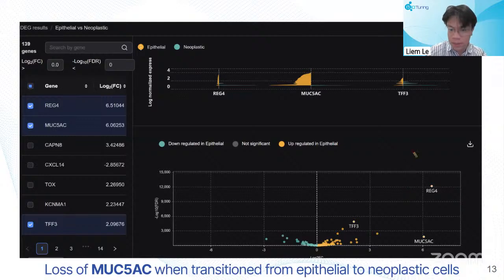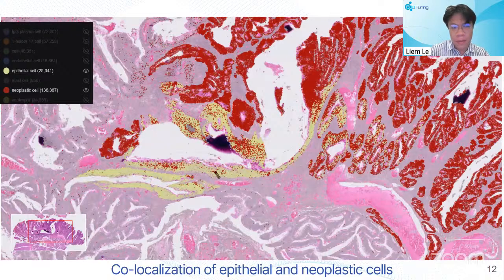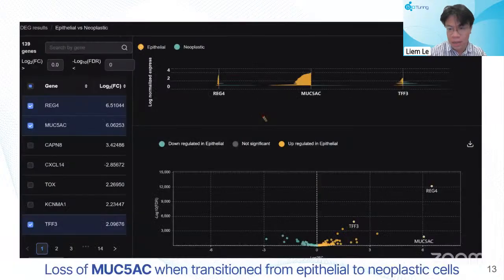Could you come back to the previous slide? I would like to mention one thing though. This result right here is not the exact cell type, but rather predictions. We have consulted with a histology expert in our team. In fact, our epithelial cell and neoplastic cell populations here are both dysplasia. The reason we have the epithelial cell and neoplastic cell predictions is that the assumed epithelial cells are actually early stage dysplasia that still retain epithelial properties, whereas the red population of assumed neoplastic cells are actually late stage dysplasia, which has gene expression that closely resembles neoplastic cells and therefore were predicted to be one of them. So perhaps we don't want to readily assign cell type to our dataset, which points to the next method of doing cell clustering and annotation.